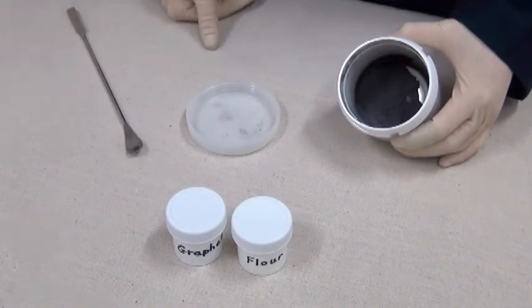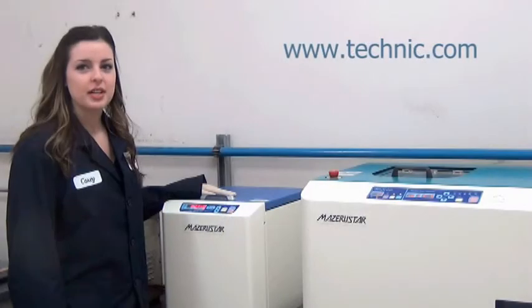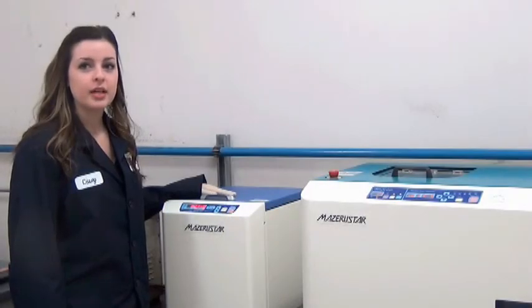As you can see, the mixing is complete. This demonstration clearly shows that the Mazira Star can mix dry solid compounds in a very short time.